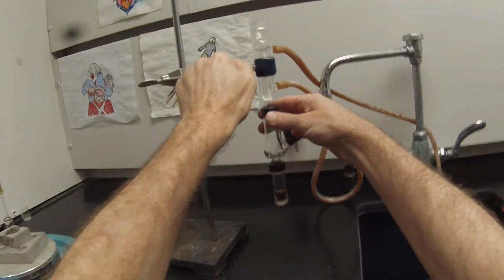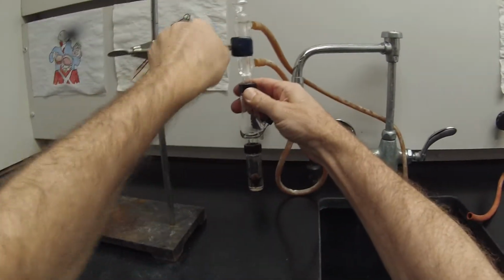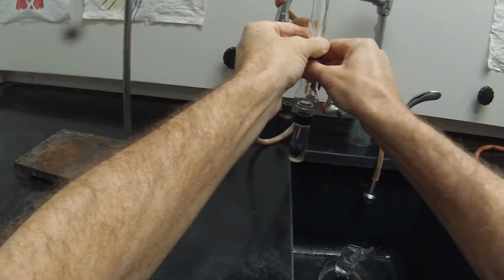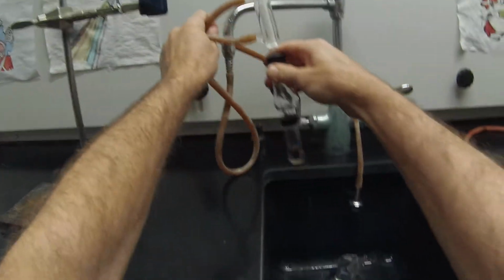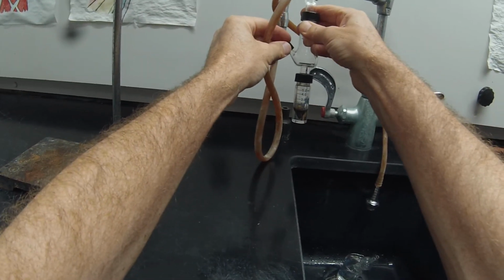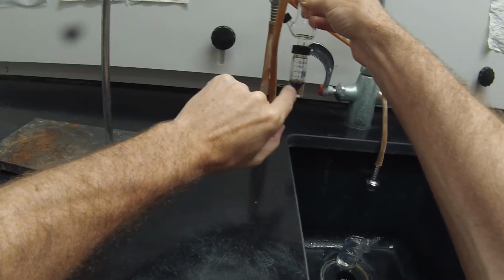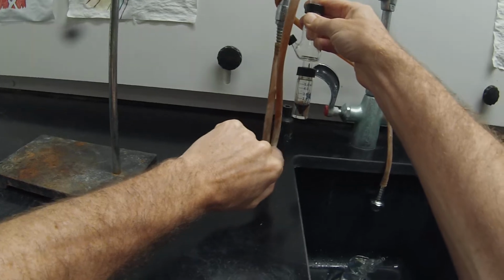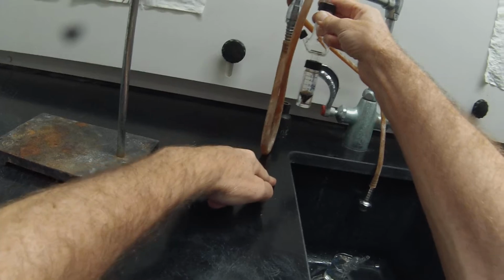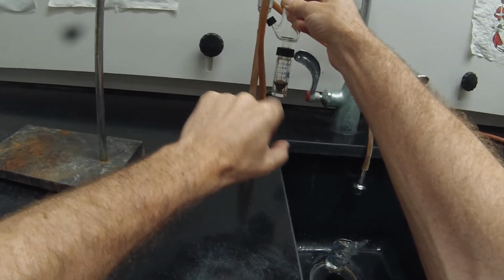So you see, if you look at the graduations on the vial, there's some liquid remaining, probably not more than half a milliliter. I could actually try to distill that a little bit more, maybe leaving a little behind. The spin vane, of course, is taking up some volume.